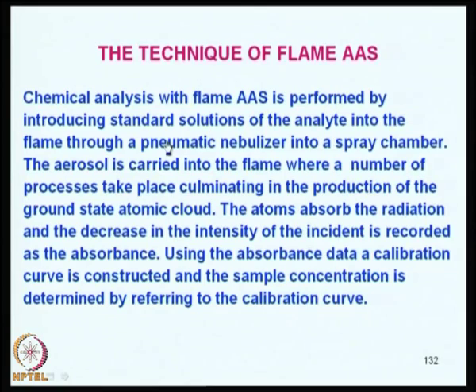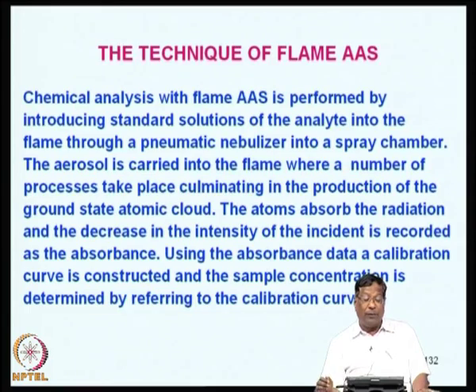First you have to prepare the standards, and then you have to pass the samples through the pneumatic nebulizer into a spray chamber. Then the aerosol is carried into the flame, where a number of processes take place, culminating in the production of a ground state atomic cloud. That is the essence of atomic absorption.